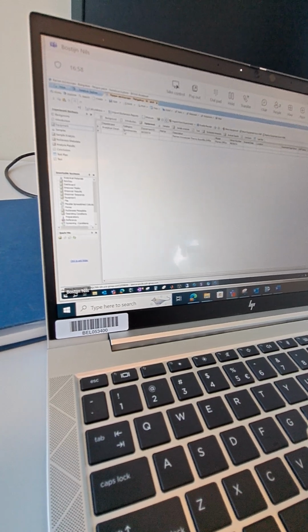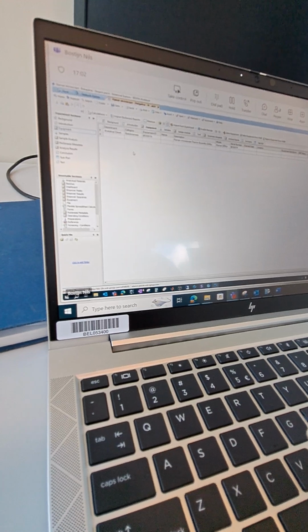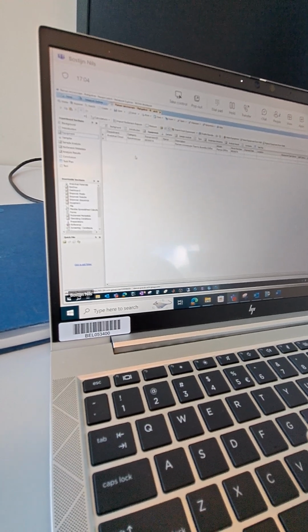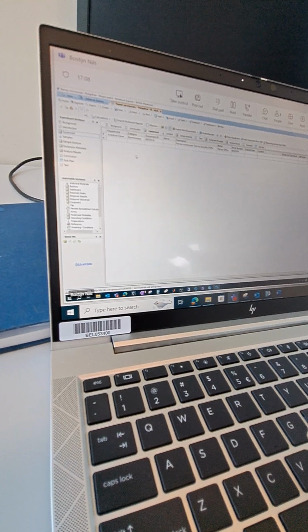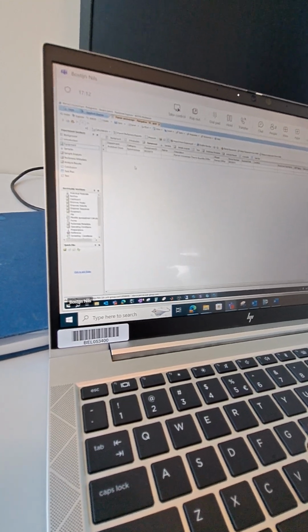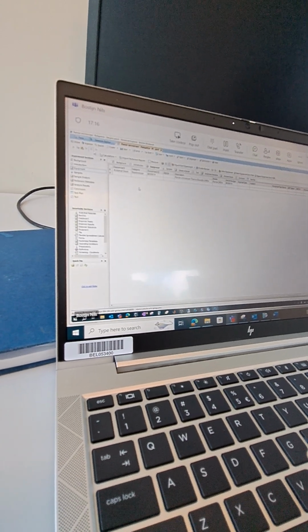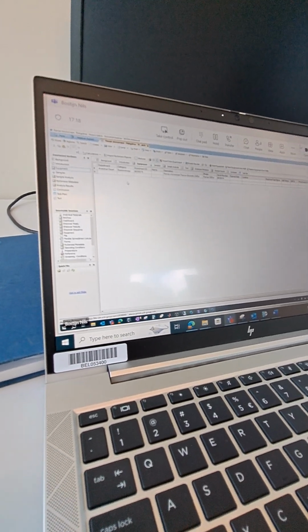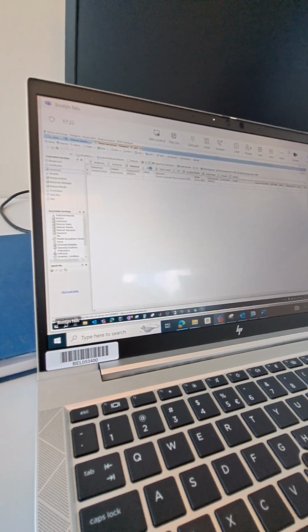Sorry, one question. So this Bruker, the X-ray, is it the flat plate one or the capillary one? It's the flat surface. We do it on small sample holders which are flat. Okay, fine. So here it's basically all the equipment you're using.